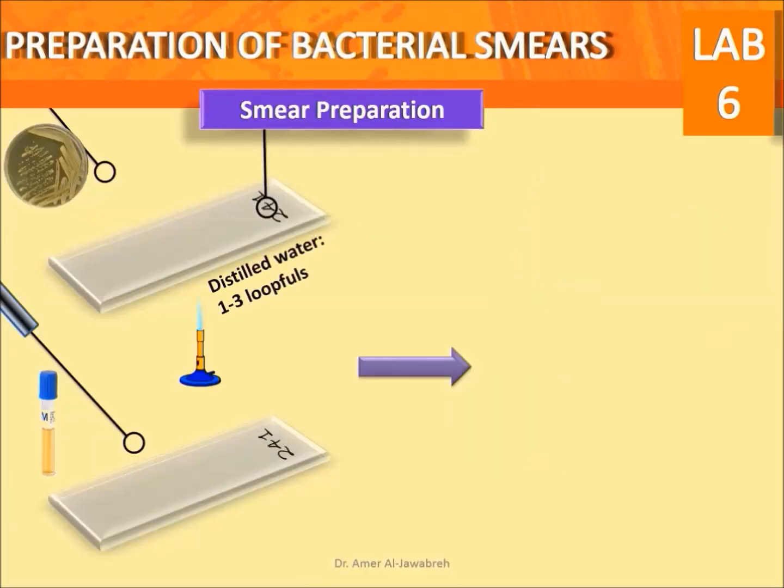Smear preparation from solid medium: place one to three loopfuls of water on the center of the slide. Pick three colonies from a plate and inoculate in a circular motion, creating an oval shape.